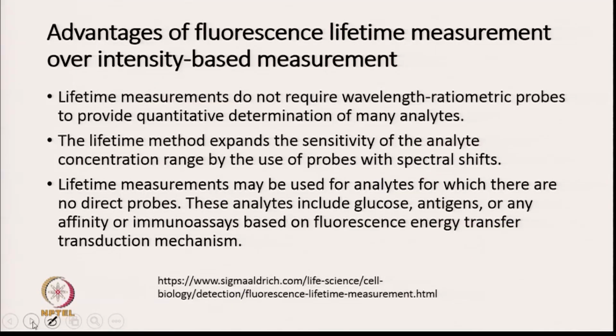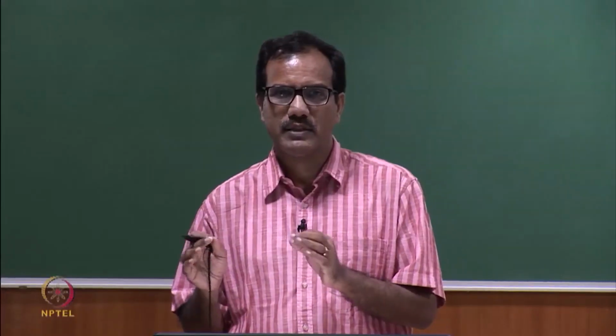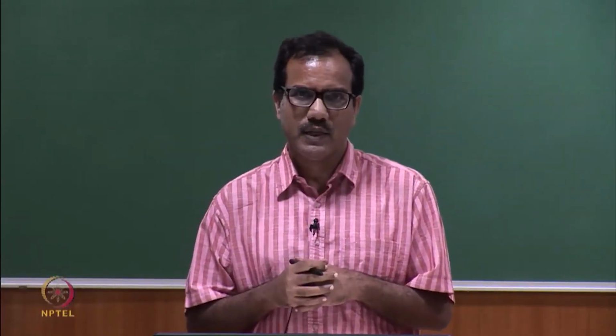What are the advantages of fluorescence lifetime measurement over intensity based measurement? One is that lifetime measurements do not require wavelength ratiometric probes to provide quantitative determination of many analytes.